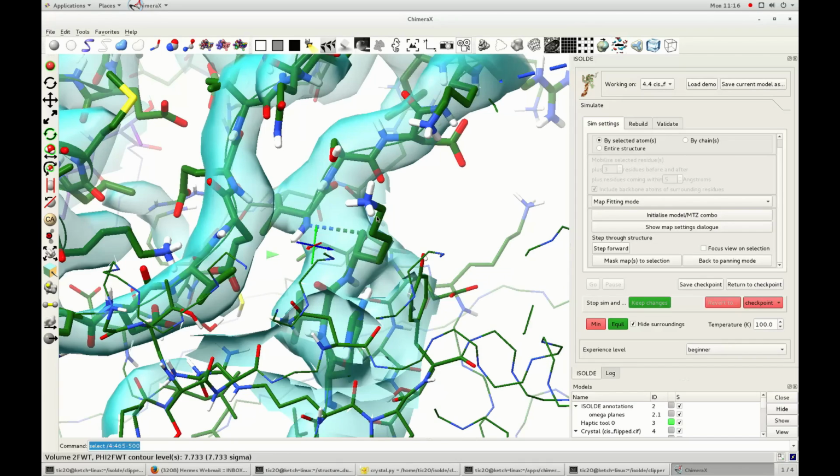Clicking Step Forward will go to the first pair of defined secondary structure elements and isolate them, along with their flanking unstructured connections. Each click will step forward in an overlapping sequence, allowing you to relatively quickly cast your eye over the whole structure. Remember, at this stage you're looking for signs of serious error. By all means, feel free to correct any obvious smaller scale errors that you find, but it's counterproductive to spend significant time on challenging spots until you're sure the surroundings are not going to change substantially.